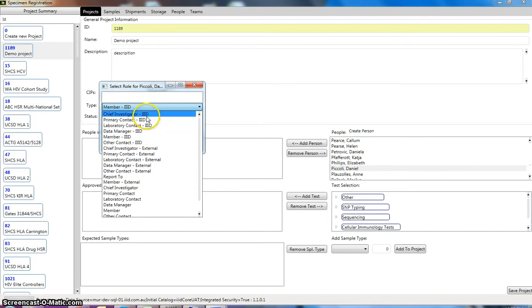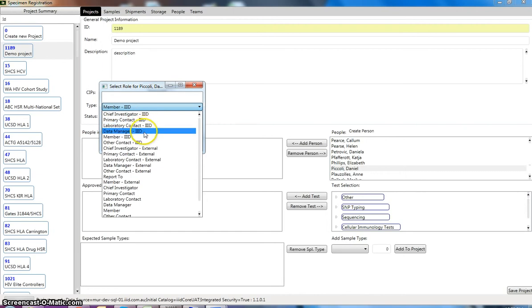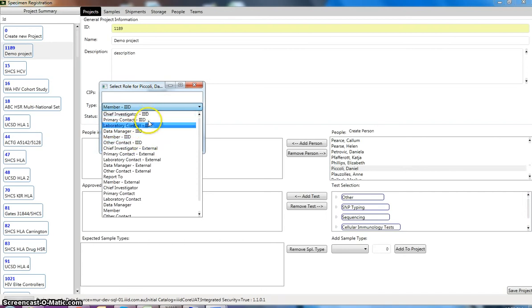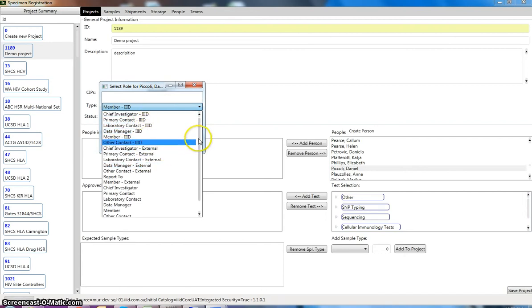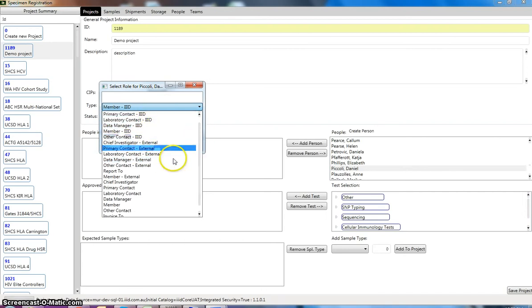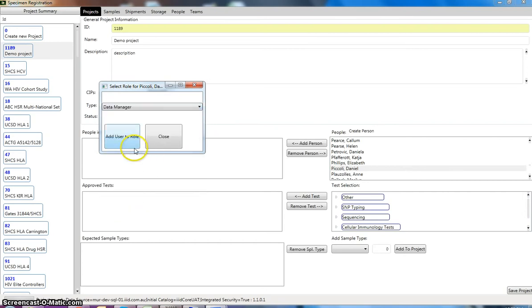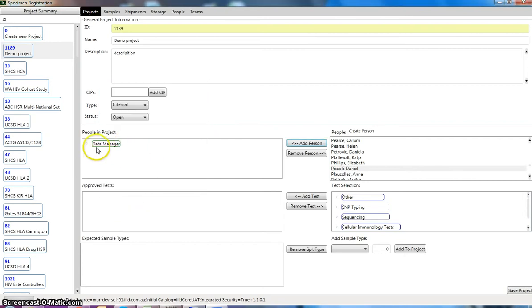So from chief investigator, primary contact, laboratory contact, member. These are our internal triple ID roles, but you can define these roles in the database to be whatever you like. So we can just say that I'm the data manager and add myself to the role. So you can see that there.